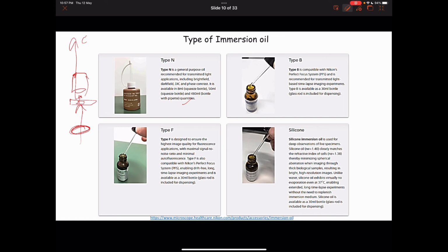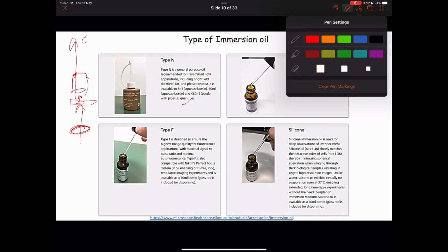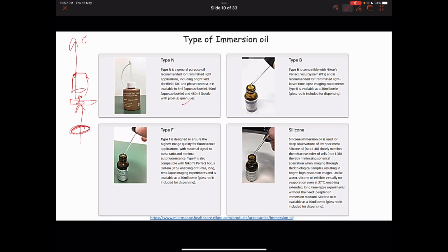Let's say there are around 70,000 frames that you want to acquire, and your exposure time is in milliseconds, let's say 20 milliseconds. We're thinking about 70,000 frames which have to be acquired one after the other at 20 millisecond exposure time. It's going to take at least 25 to 30 minutes, after focusing, to acquire all the frames which will contribute to a single reconstruction of your super resolution microscopy image.